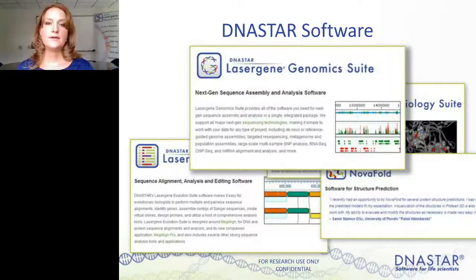And today I'm going to be talking about our 3 core applications in the Lasergene Genomics suite. And in here we have all the applications that you would need for your next-gen sequencing assembly and analysis, all integrated in one useful suite of products.